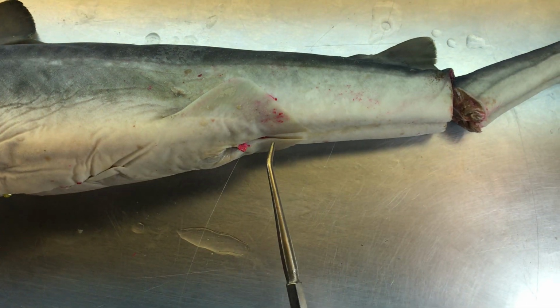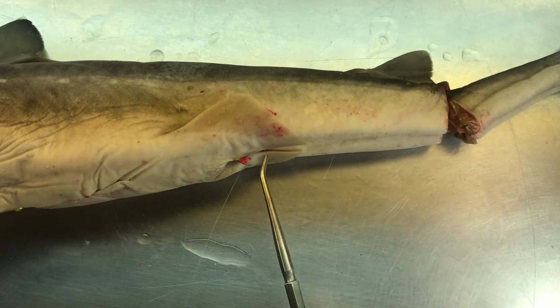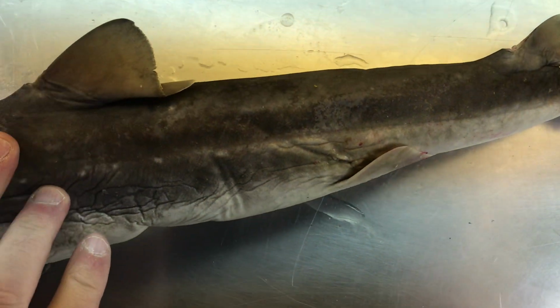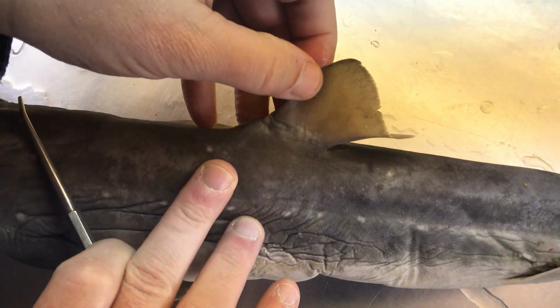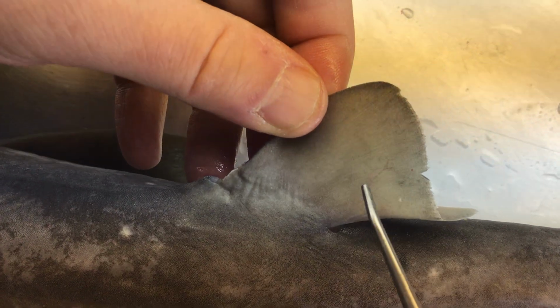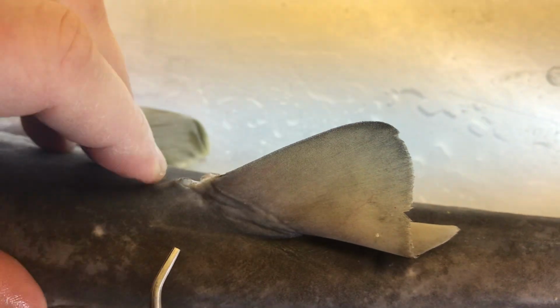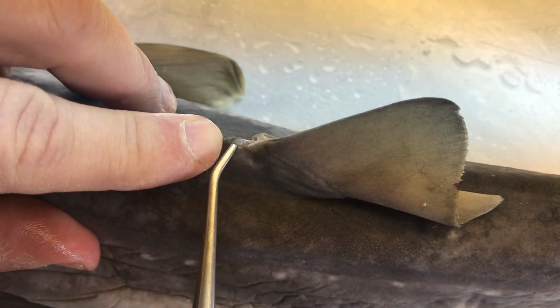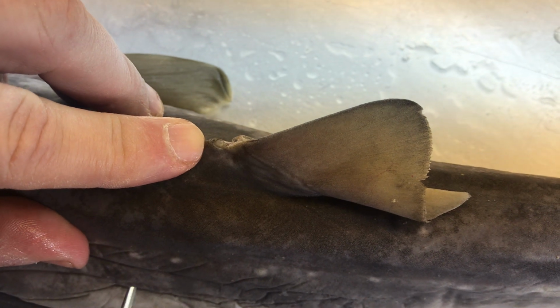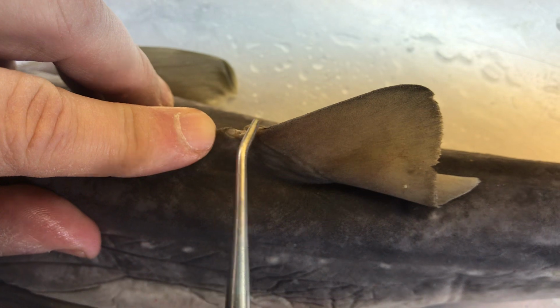This is a female. If it was a male, there would be another structure on the inner margin of these pelvic fins. Now, the fins themselves have rays. The fin rays, you can barely see them. These are the cartilaginous flexible support structures on the fins. Now, what's been cut off is a spine. A spine is an inflexible, sharp structure. These are cut off, otherwise they'd puncture the plastic bags in which they store the sharks. So the spines are basically there for defense.